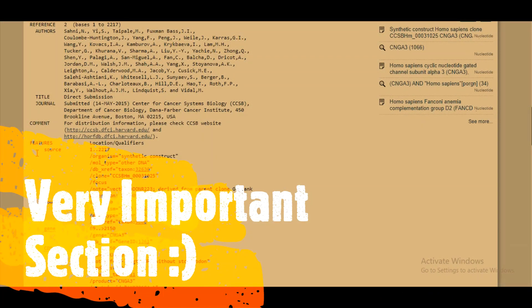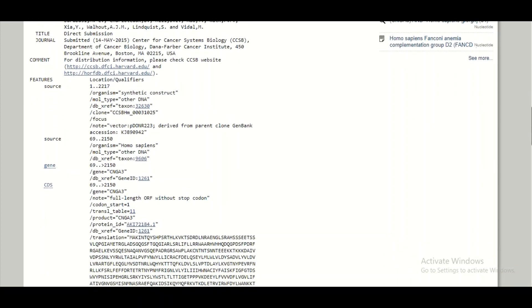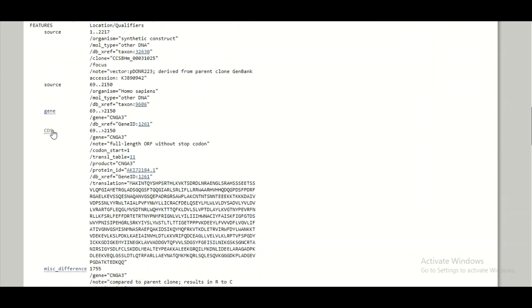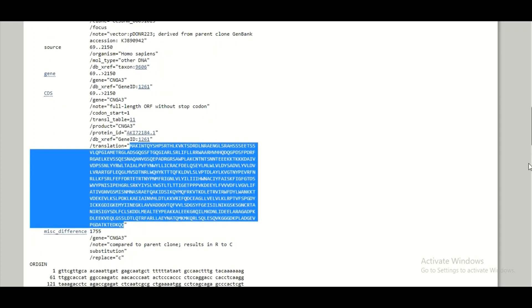The second section on this page is the feature region, which contains a great deal of information about the properties and characteristics of the gene sequence — for example, whether it is exonic and what protein it encodes. Under CDS (coding sequence), I can see that nucleotides 69 to 2150 form the coding region, and this coding region will produce a specific protein that I can copy for further bioinformatic analysis.